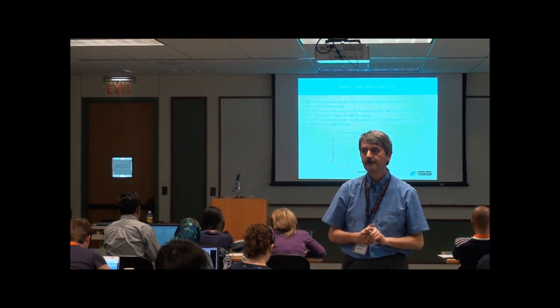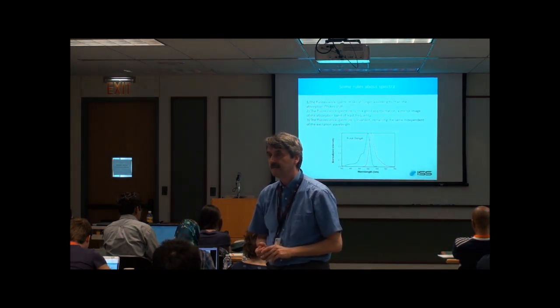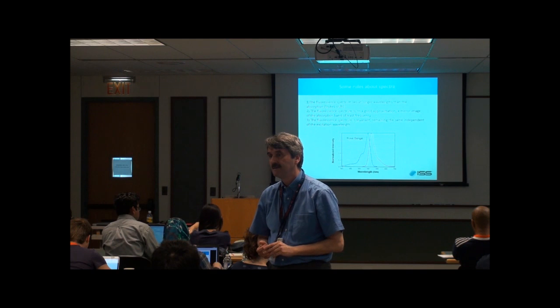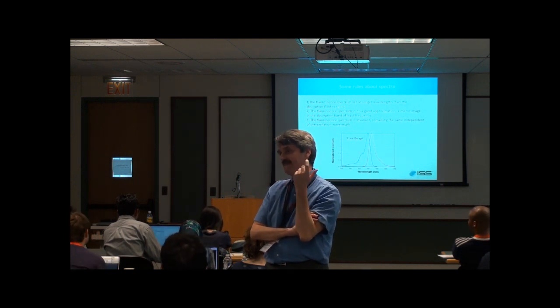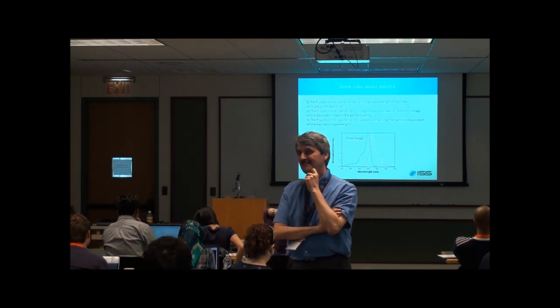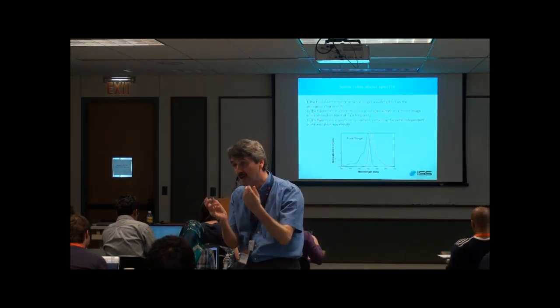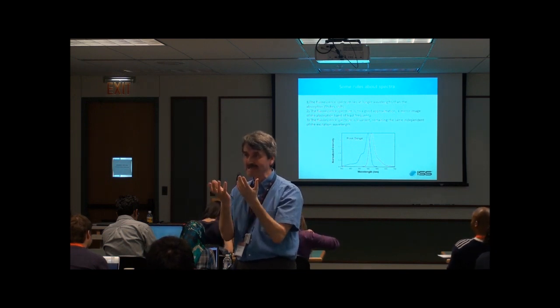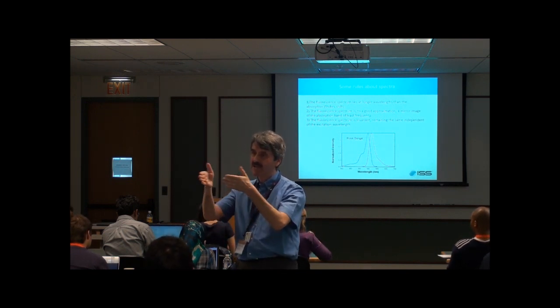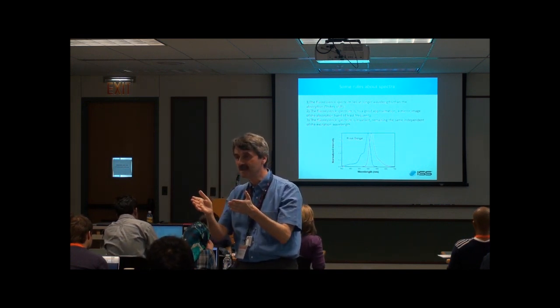Any other questions? Yes. You showed this slide where you measure light pulses with this blue LED, and the excitation pulse length was rather long, I would say. Do you convolve your data, or do you do other tricks other than the convolution? Right. All the theory is based on the assumption that we use a very short pulse of light. In practice, the pulse sources have a finite pulse width. A laser diode is about 70 picoseconds.